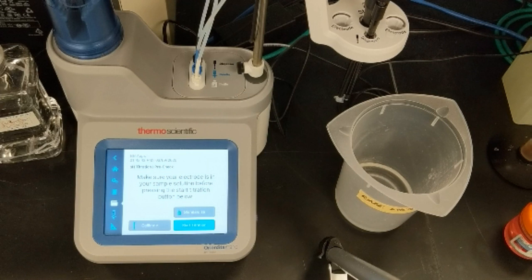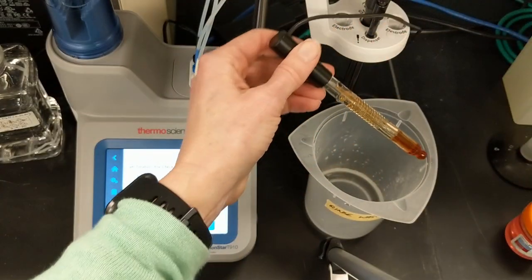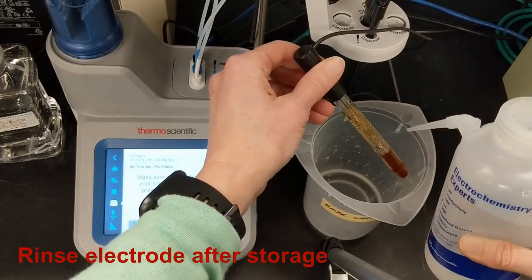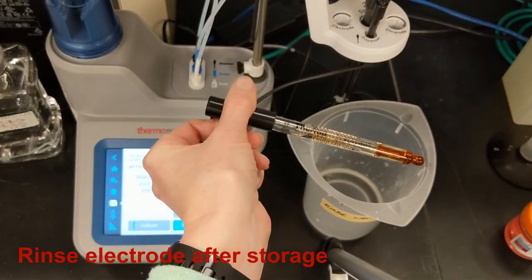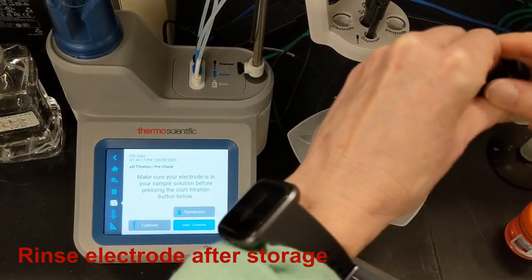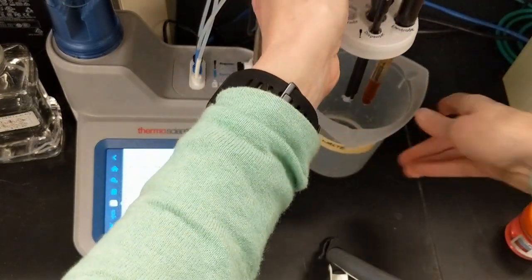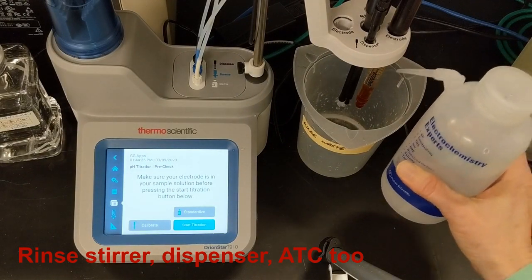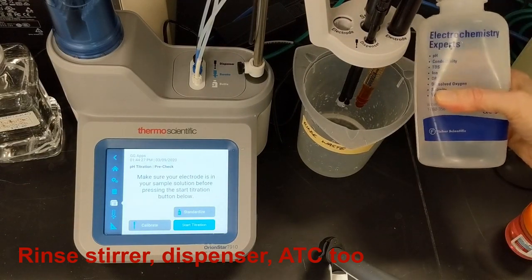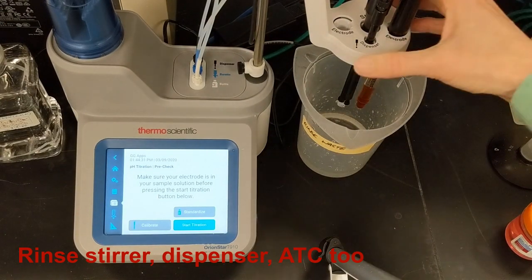We'll start by calibrating. It's important to rinse the electrode thoroughly after storage to remove all traces of the salty, buffered storage solution. I'm using the Orion 8172 BNWP Ross SureFlow electrode, which works great with the titrator. After rinsing the electrode, I'll rinse the stirrer, dispenser, and ATC probe too. This ensures that I don't carry over any residue from the last titration into my new titration.